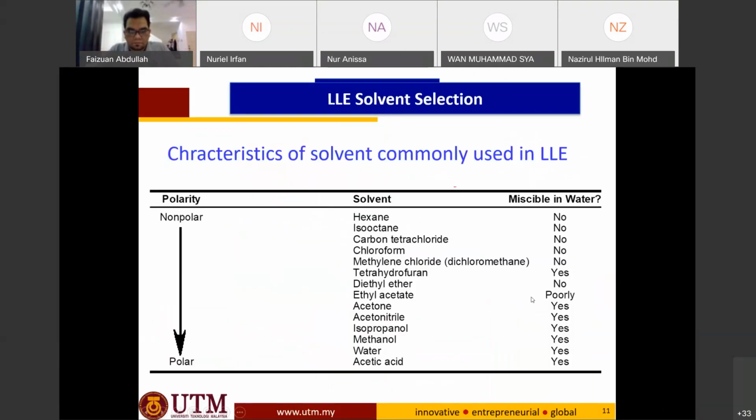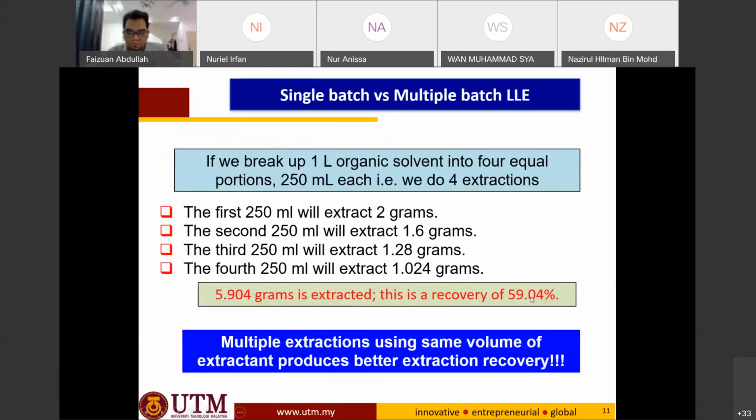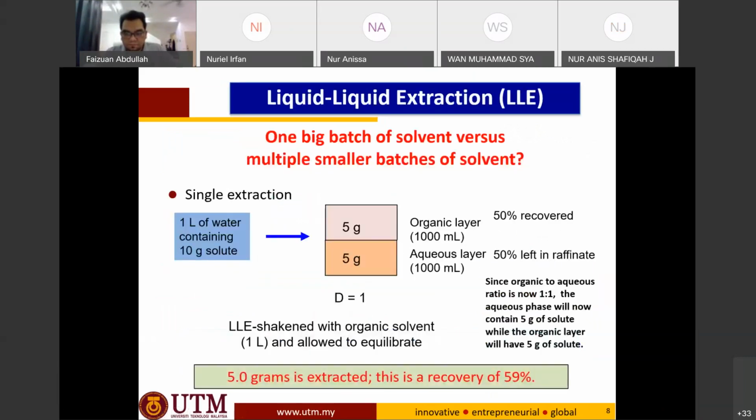Can get accurate amount to extract the sample. Dual step is better than single because we can determine the accurate amount of samples to extract.